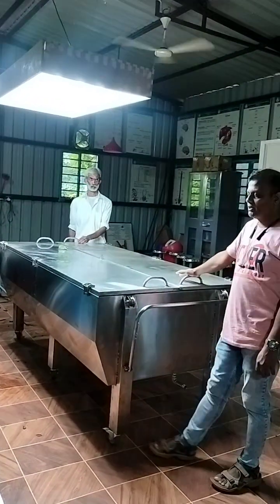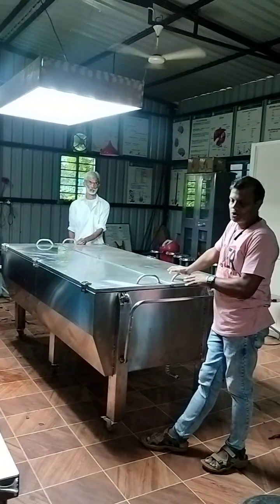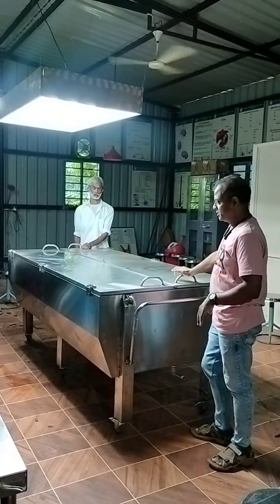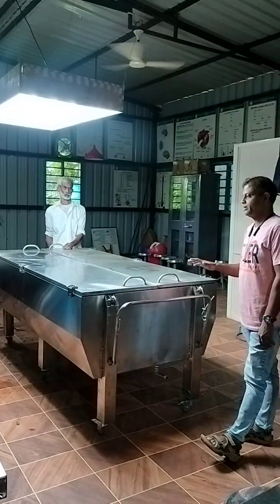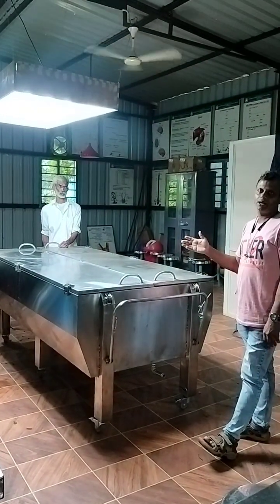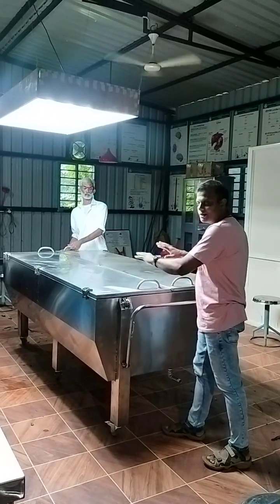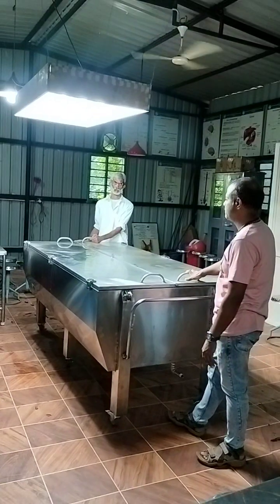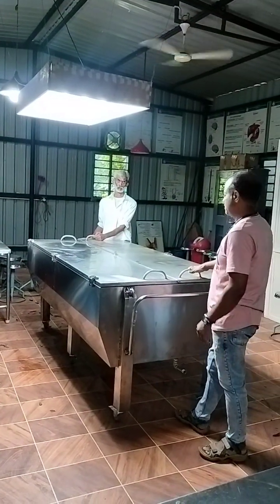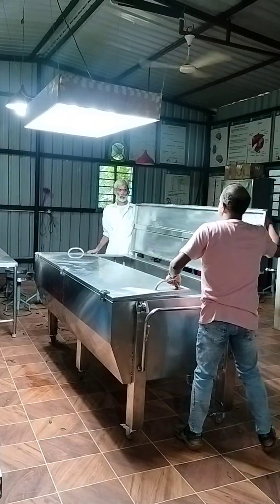This can be used as a dissection table also. This is a 2-in-1 system where you can store the body with formaldehyde and then you can dissect it and then place it back. The entire cabinet is made of corrosion-resistant materials compatible with formaldehyde to ensure zero corrosion. So this we can open the package.